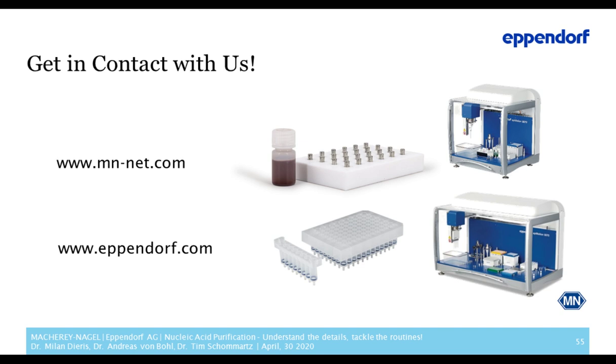Thank you, Tim. And we have time for one final question, and I'm going to go ahead and have you answer this question as well. How do we handle steps like centrifugation during automation when we choose to use silica columns for NA purification? Yeah, also a very good question.